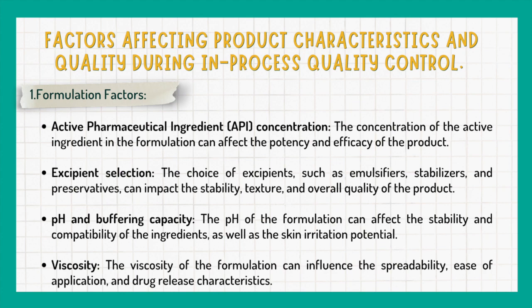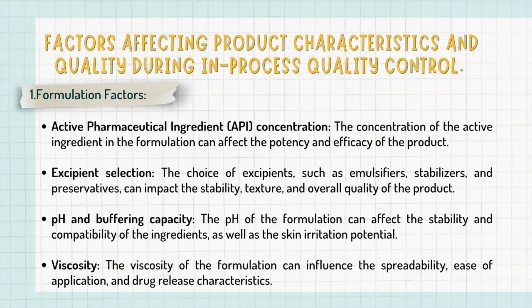pH and buffering capacity. The pH of the formulation can affect the stability and compatibility of the ingredients, as well as the skin irritation potential. Viscosity. The viscosity of the formulation can influence the spreadability, ease of application, and drug release characteristics.